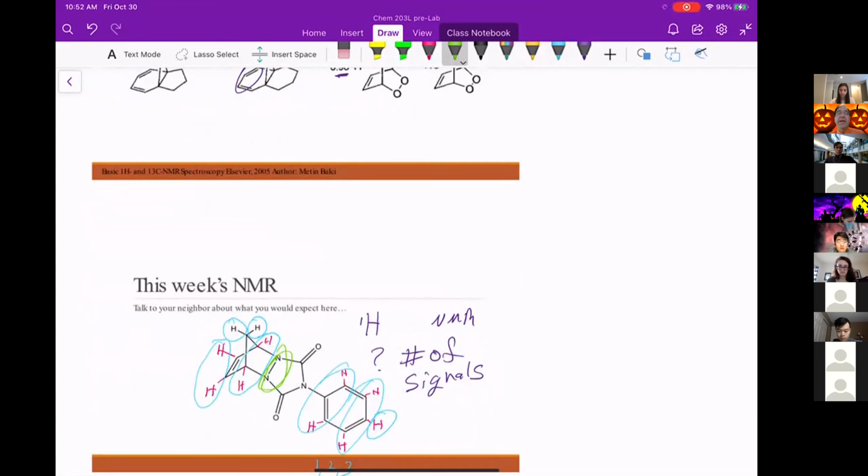We're going to be reacting our double bond, our dienophile, which is actually going to be a nitrogen-nitrogen double bond instead of a carbon-carbon double bond, which I always kind of like because it's nice, bright pink. It's this beautiful magenta pink color, kind of like if you took your phenolphthalein endpoint way too far and on steroids. It's a really pretty color. But it is the hetero-Diels-Alder reaction that we're going to do. We're going to make that product, and then we'll try to interpret the NMR on that one. Okay, so I'm going to stop the recording here because that's the end of my regularly scheduled presentation.